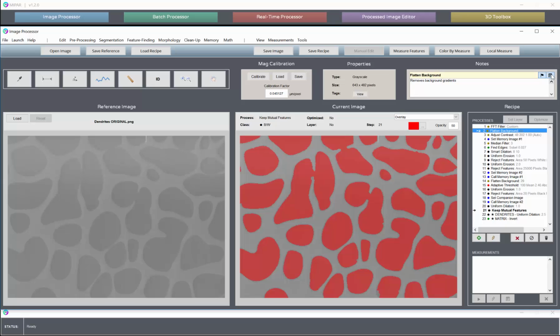You can switch back to looking at the help just by switching back into help mode. It doesn't erase the note, it just shows you the default help text. You can always look back or edit the notes by switching back into notes mode. To erase notes, just remove them and click off. The notes icon goes away. To unflag a step, just turn the flag off.